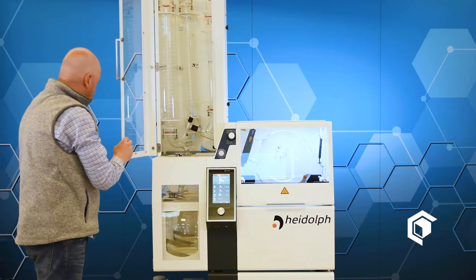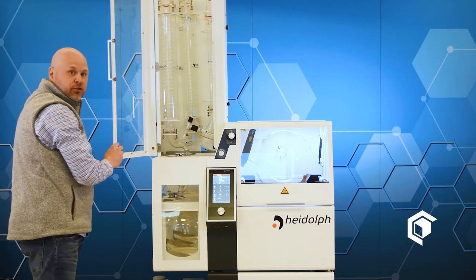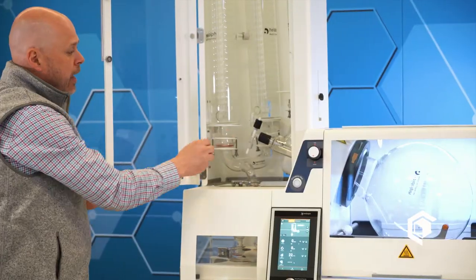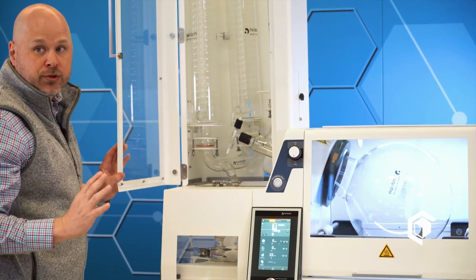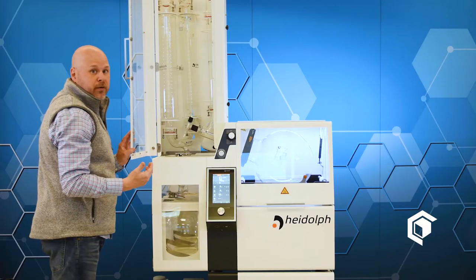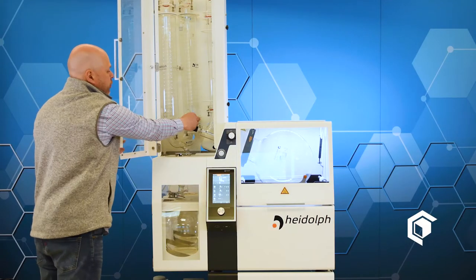Let me show you a feature that most people don't recognize: this is the refill valve. So if you have your material outside in a 5-gallon drum or 55-gallon drum, you can actually manually fill the flask without even taking anything off, so you continue your run. That's one advantage of having a refill valve.